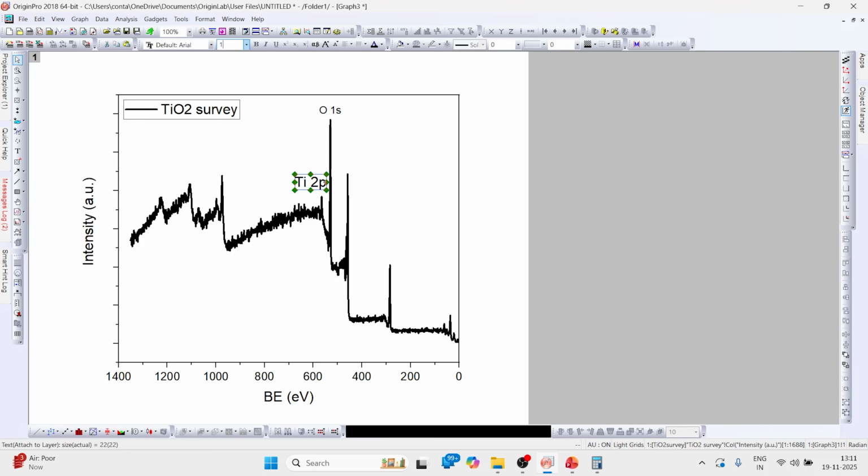You can alternately copy this text box and use it for labeling the others by updating the text information. This will help to keep the format. You don't have to do the formatting again.